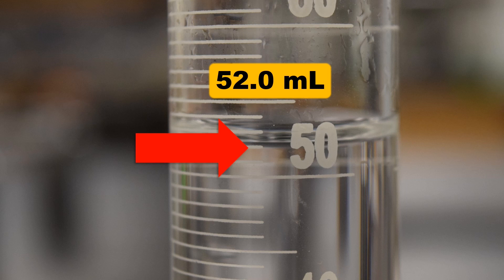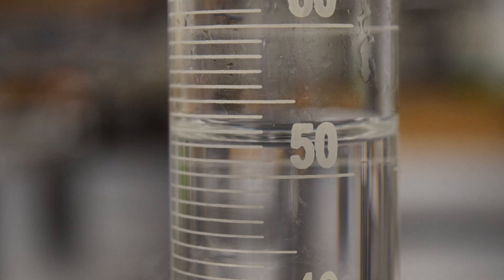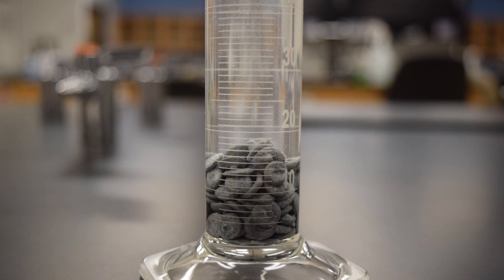Measure the initial volume of water present, then add the insoluble metal pellets. We'll utilize the Archimedes principle, which states that the metal pellets will not dissolve in water, and thus, when placed in water, will displace a volume equal to its own volume.